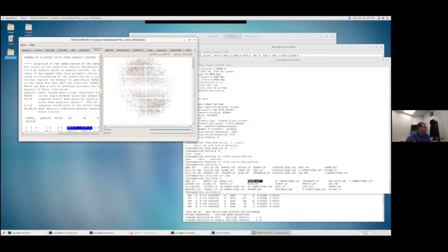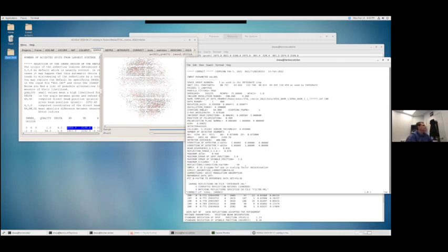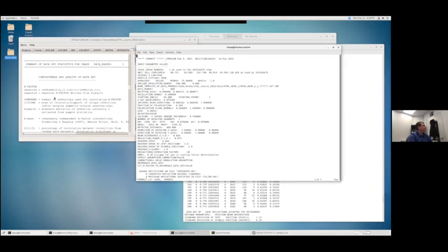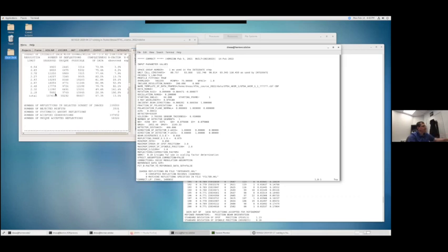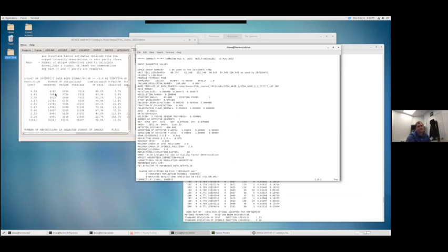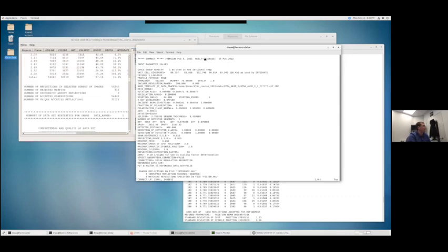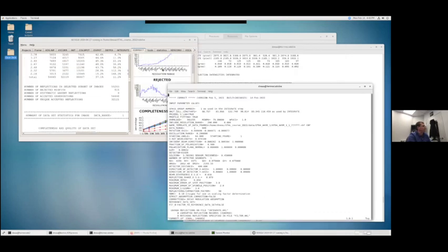The log files are these ones called LP, and so each step generates an LP file. And so you can look at those. For instance, if I go and look at the correct.lp, this information here is exactly what we're seeing over on the left of the XDS GUI window. The advantage that the XDS GUI does is it then graphs out these values on the right.